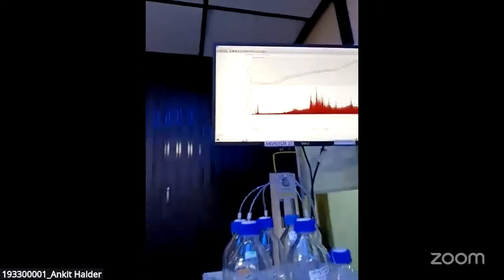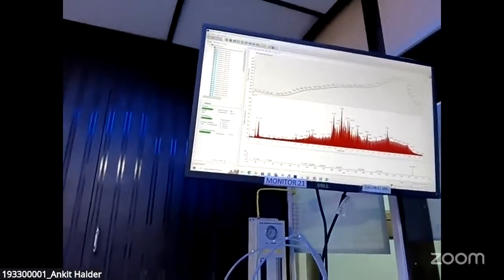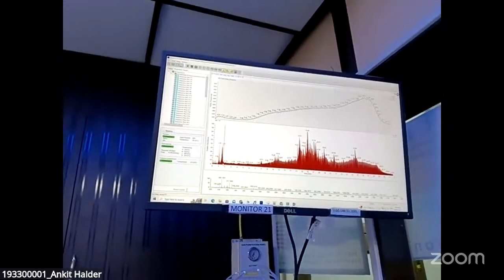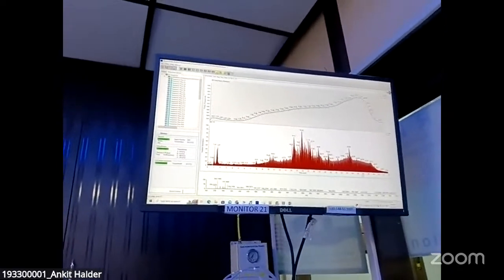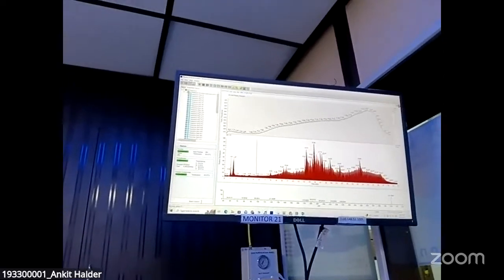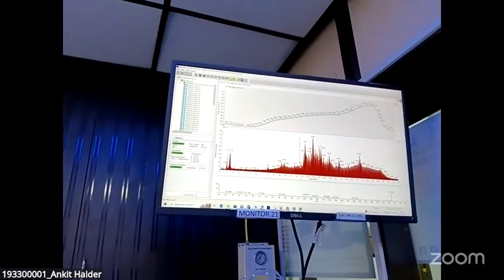This is a typical chromatogram, the total ion chromatogram of all the ions that are generated after elution, after they have passed the electrospray ionization. This is how the ions are detected over time. Here you can see this is the time, the retention time. This was a 32-minute gradient that has been passed through, so the compounds have been eluted out.